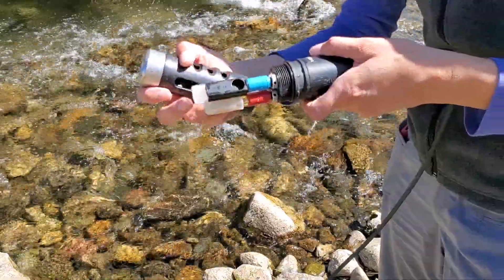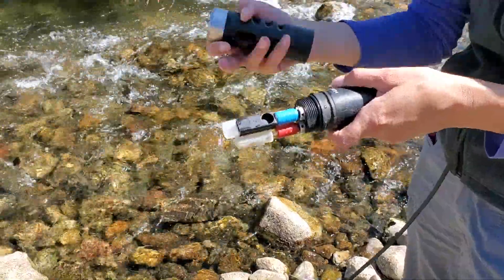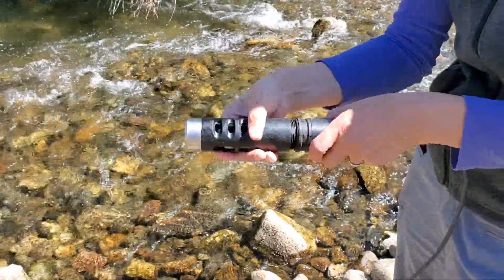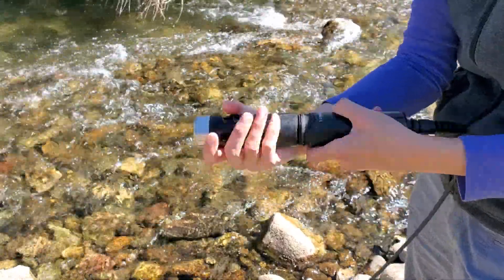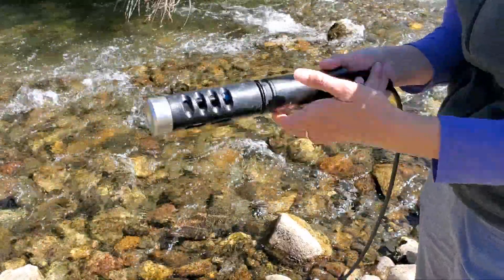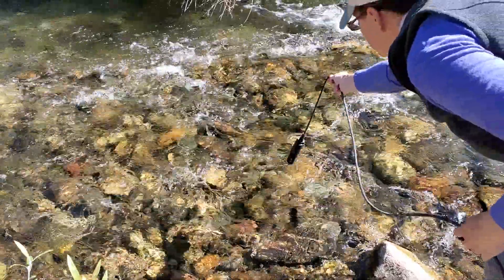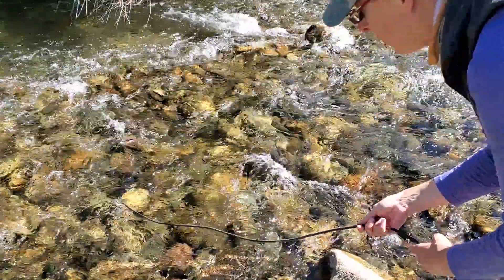I've got covers on these probes at the moment. I'm not going to take them off for demonstration purposes, but if I was actually taking measurements, I would remove the probe covers. So we put the apparatus on the cover that's going to protect the probes from hitting against rocks. We would place it into the water, into the flow of the water.